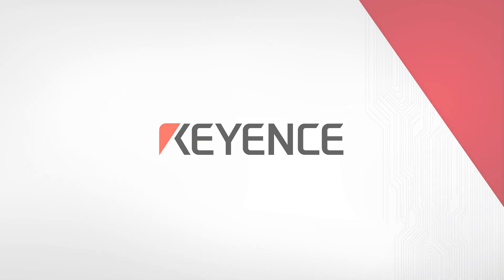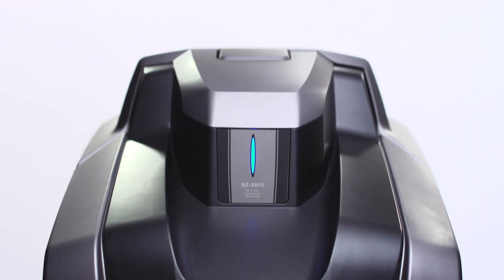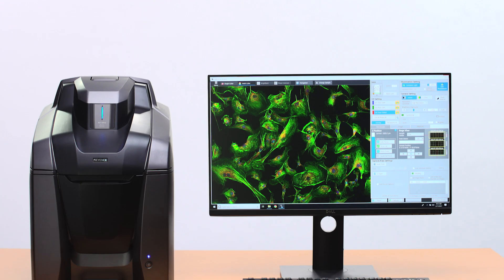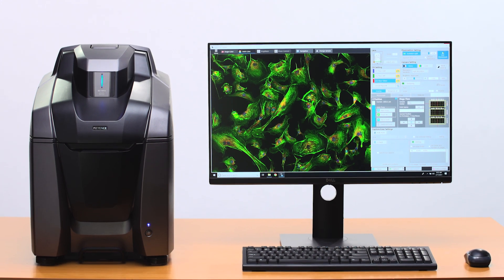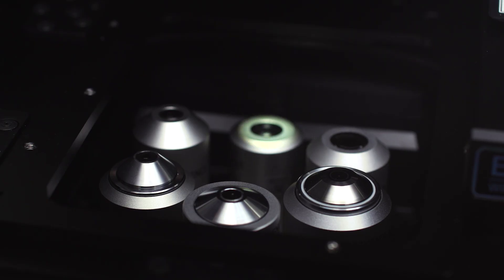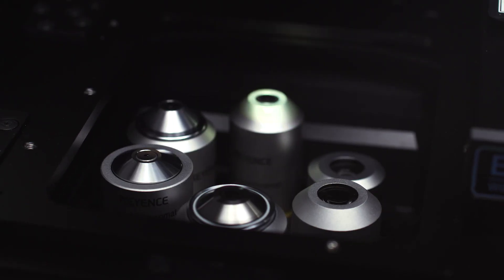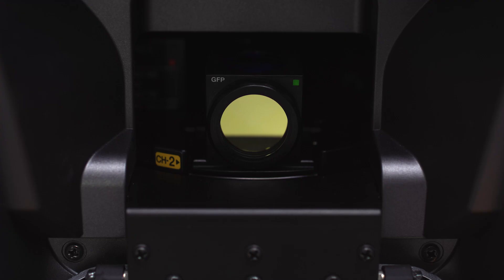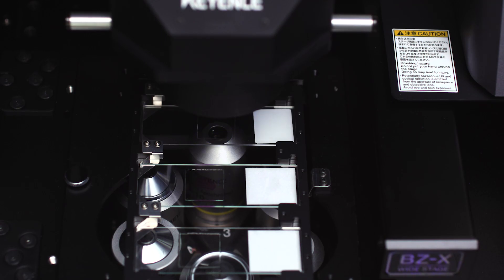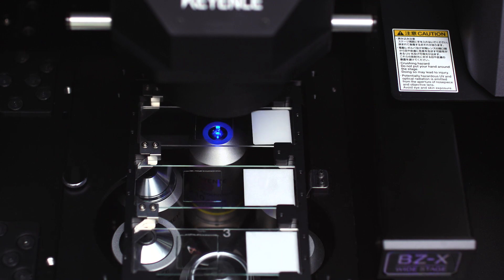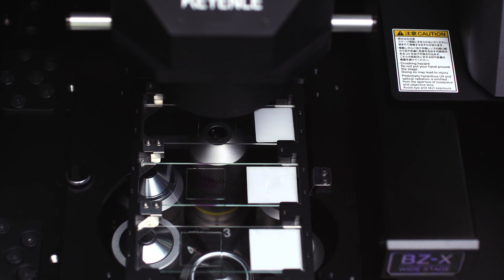Introducing the latest life science microscope from Keyence, the BZ-X All-in-One Fluorescence Microscope. The BZ-X series is an automated imaging system designed to quickly and easily capture publication-quality images and perform high-volume data quantification on a wide variety of applications.